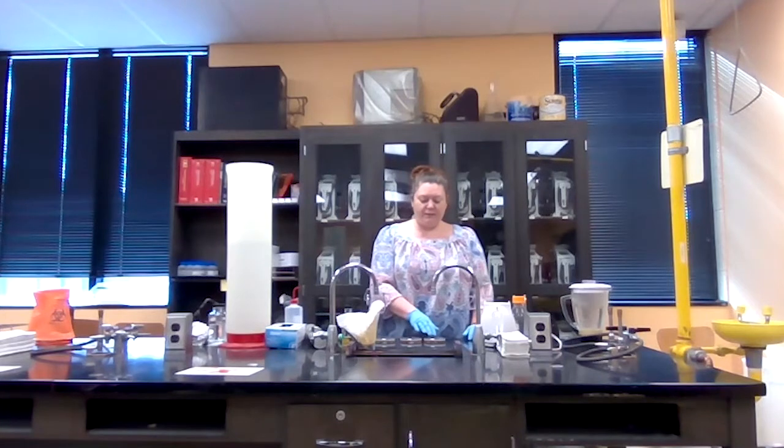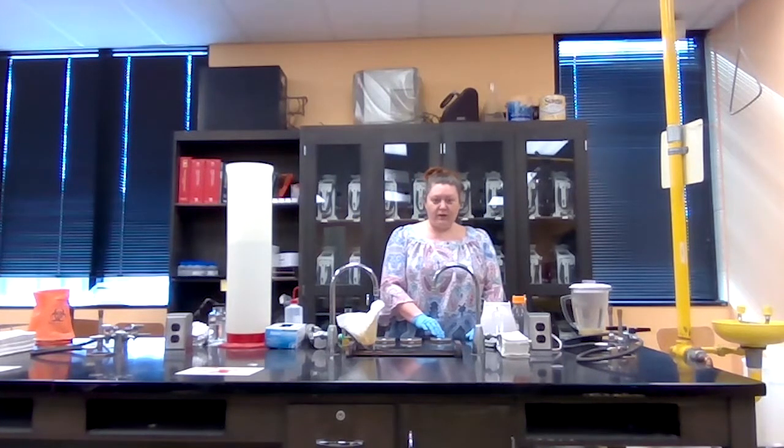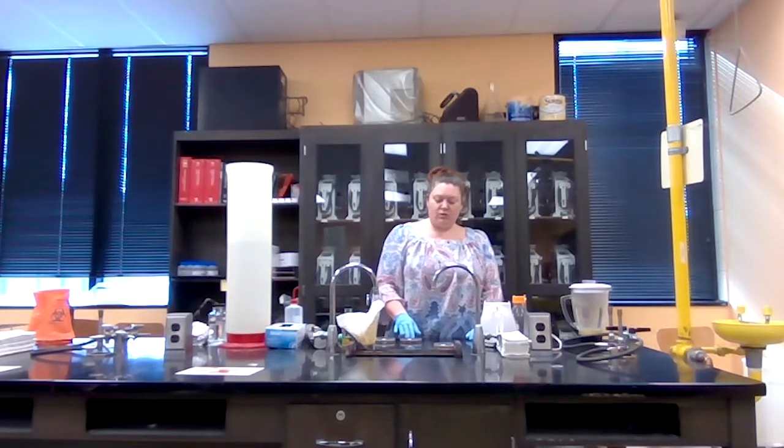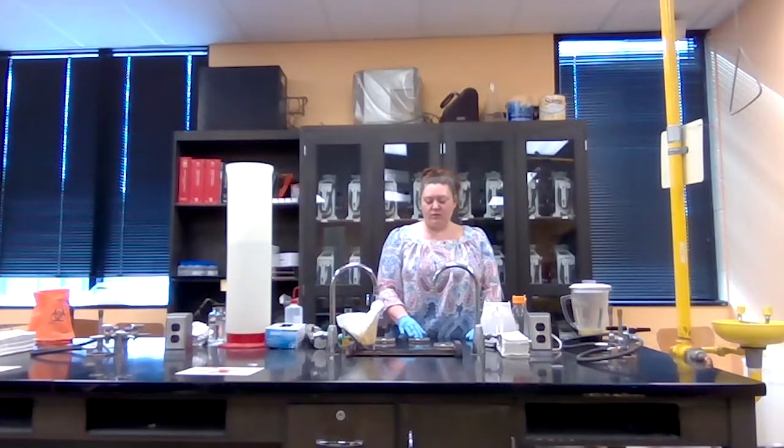Okay, and then I put a couple fingers on here and just in slow figure-8 motion, I swirl these plates around. And I do each plate for about 10 seconds or so. By swirling them for about this long, that way I can ensure that I've actually mixed it really well, because we want the bacteria, if there's any in here, to be dispersed evenly throughout the entire petri plate. We don't want it to all clump up in one area or one corner, because then we wouldn't be able to count it.